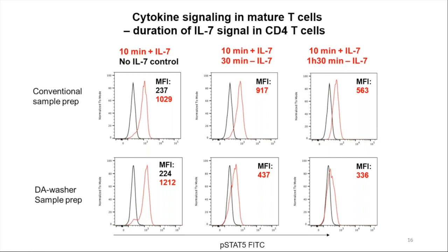Great, thank you. Another question: why do you think antibody staining is stronger on the DA plate than conventional plates? Isn't it using the same antibody concentration and incubation time? So it is using exactly the same antibody. In those experiments, we're using absolutely the same antibodies, and the samples in all the experiments I'm showing you are exactly the same cells, and everything was processed in parallel.